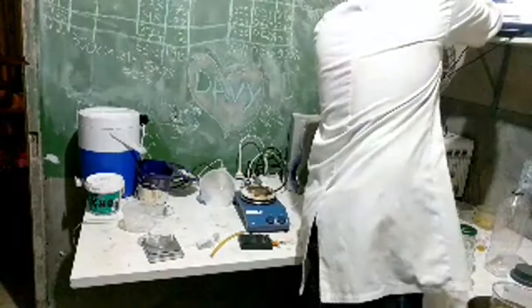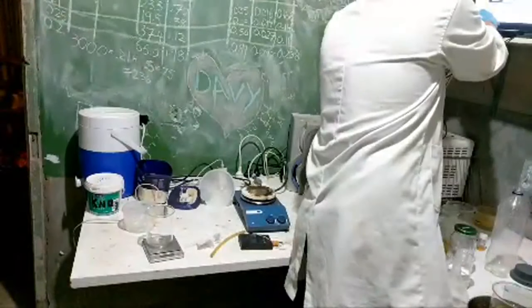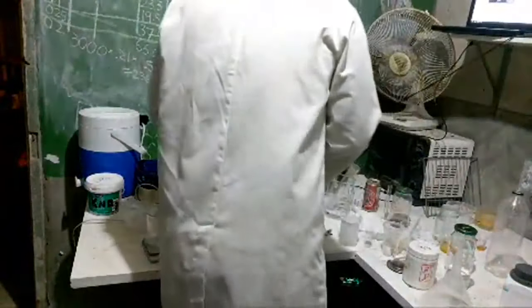Alright, I'm feeling very patriotic. Our chemistry. What's the chemistry? What are we doing? Small scale first. No, just use... I don't have iron chloride. It doesn't work like that. Alright, we've got disagreement. This is hard to work. I'm gonna add hydroxide to this, I reckon.